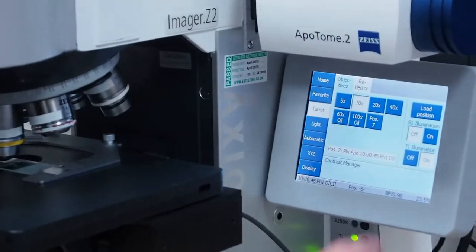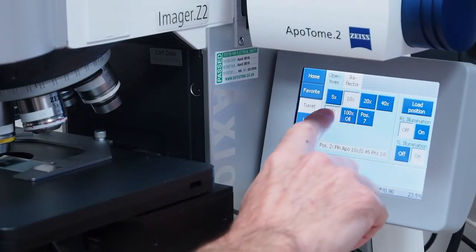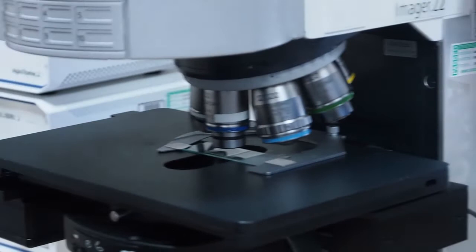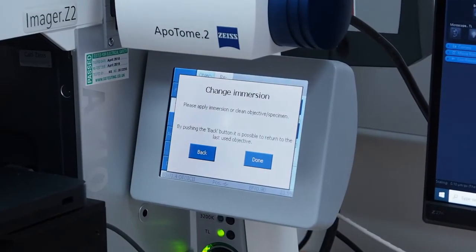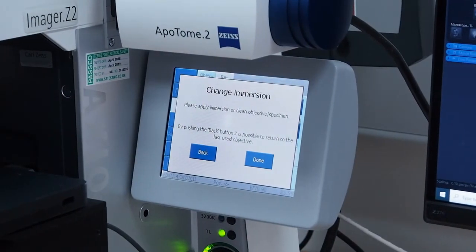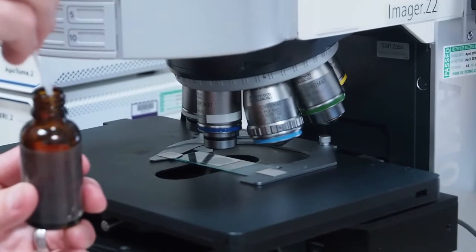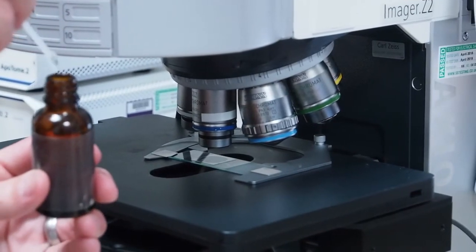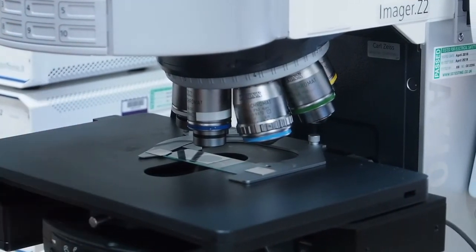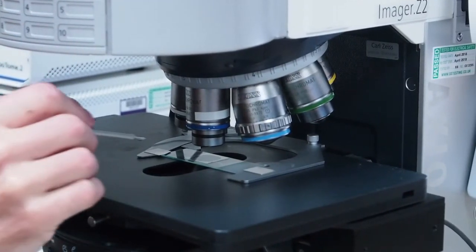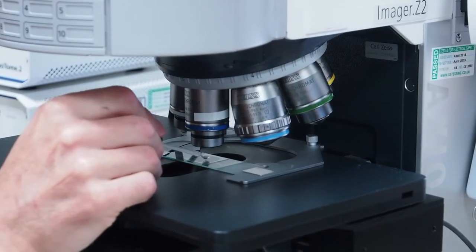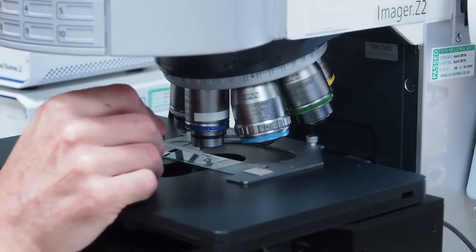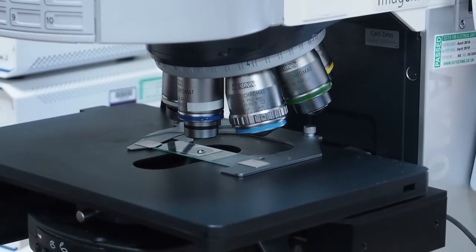Under the microscope tab of the touch screen, choose the objective you wish to use that requires oil. The objective nose piece will revolve to the chosen objective and the stage will move down. The touch screen will freeze and ask you to apply the immersion medium to your cover slip. Using the applicator attached to the lid of the oil bottle, collect a small drop of oil on the end and carefully apply a drop to the cover slip directly underneath the objective.